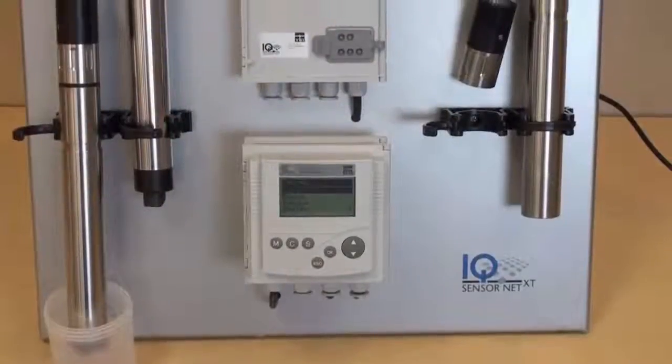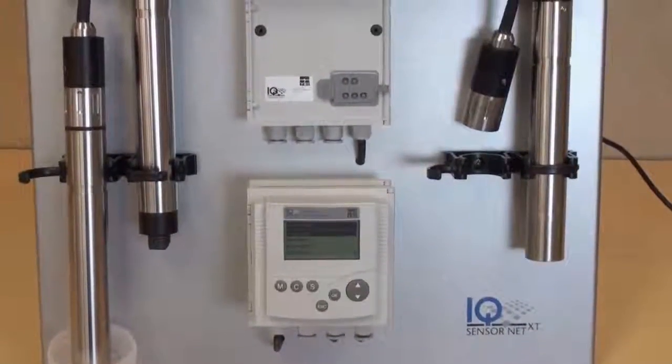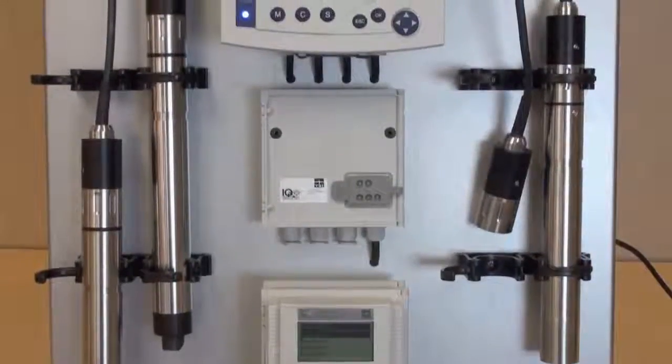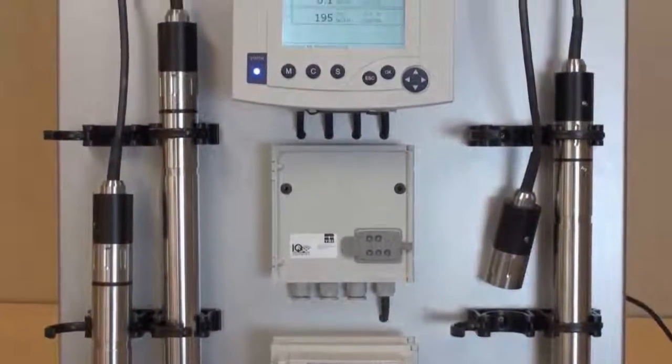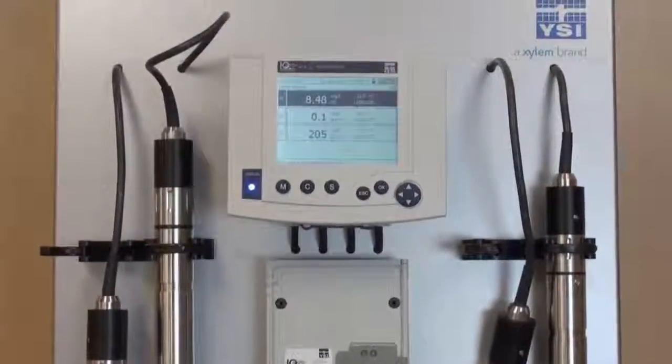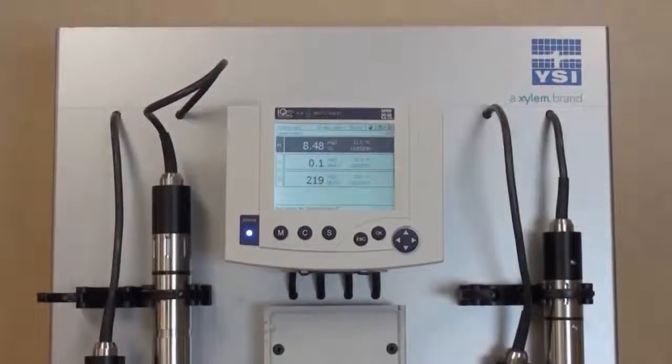Hi, my name is Laura St. Pierre and I'm a product manager for the iQ SensorNet system. The iQ SensorNet is a network of probes and analyzers designed to continuously monitor the wastewater process to help understand the process and improve efficiency. I'd like to discuss the optical dissolved oxygen probe, the FDO, that's designed for the iQ SensorNet system.